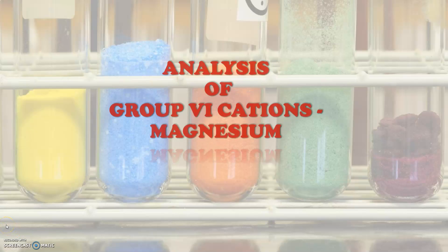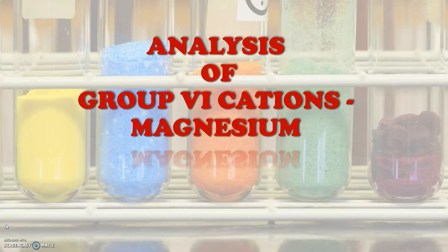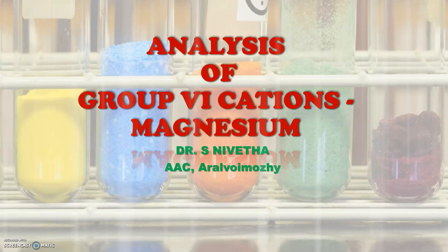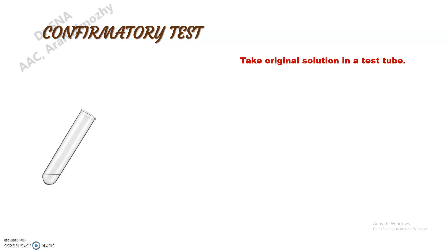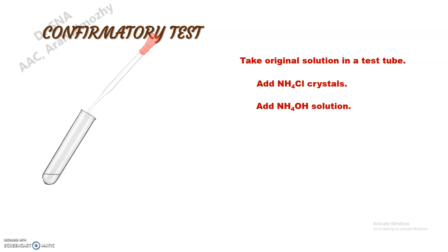Let's see how to analyze magnesium. It is a sixth group cation and how to confirm this: first, take the original solution in a test tube and add ammonium chloride crystals and mix it well, and then add ammonium hydroxide solution.